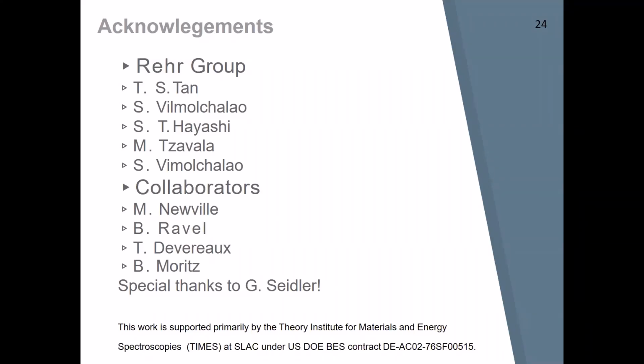Yes. Yeah, no, I agree with that. And I think as a development strategy, we've always kept expert user possibilities there. So for FEFF, for example, you can give it a very minimal input where general properties are pretty much the only thing you'd specify.